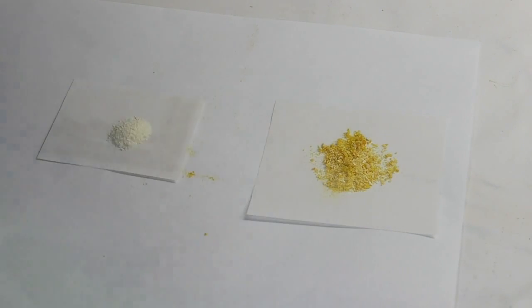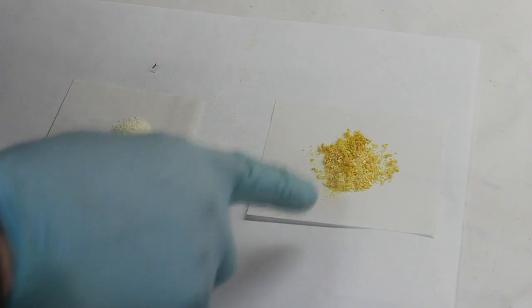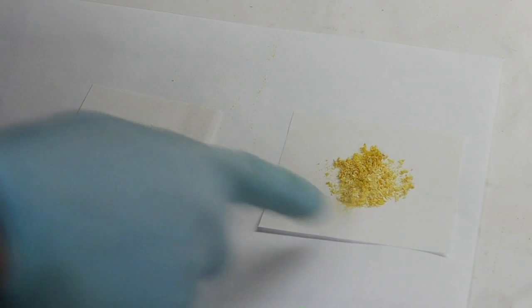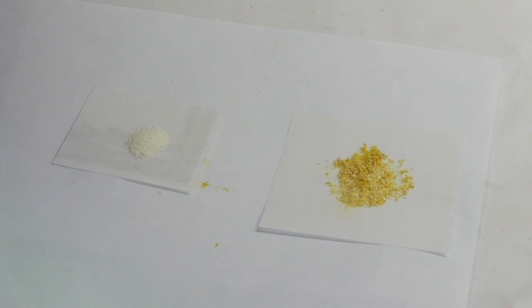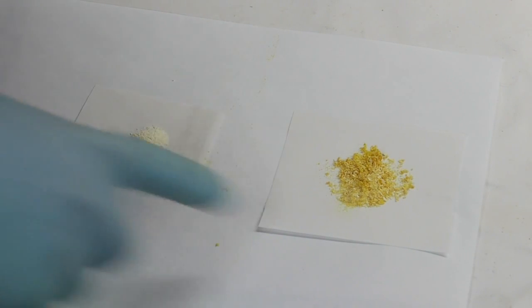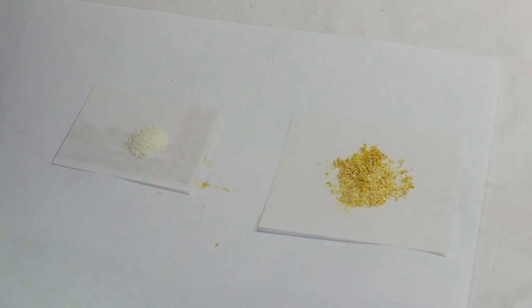So here we have the caffeine that I just extracted today - this is from coffee, which I'll get into in a minute - and this is the batch from last time from the green coffee beans. As you can see, there's quite a bit more impurities in the batch I made today, so let me show you the process and explain why it looks like that.